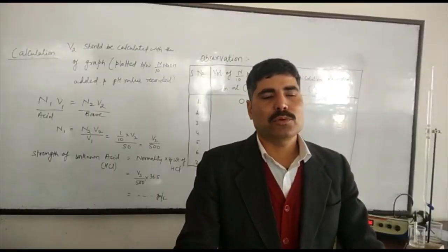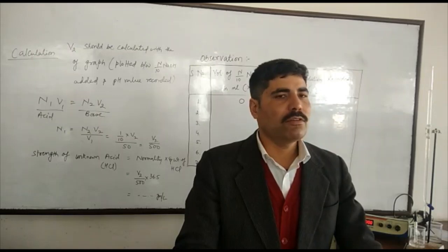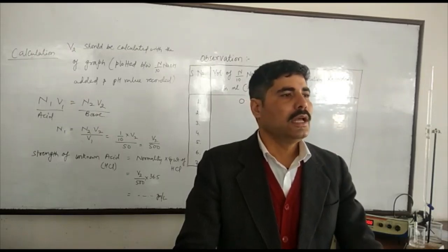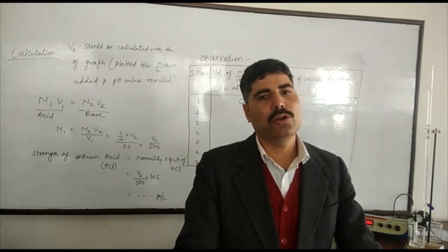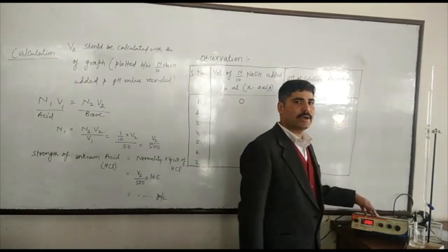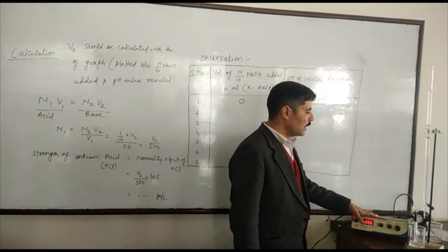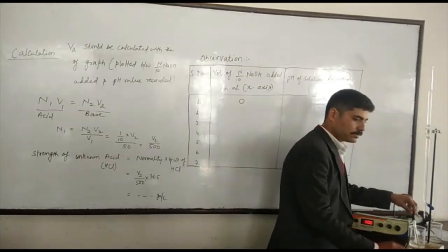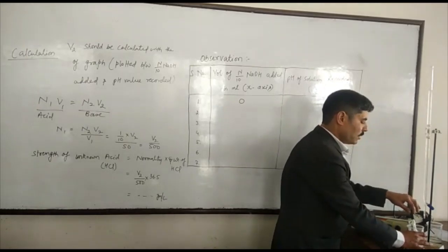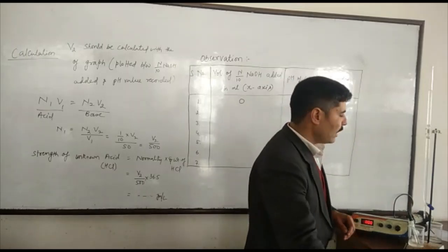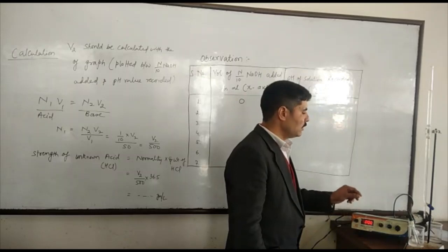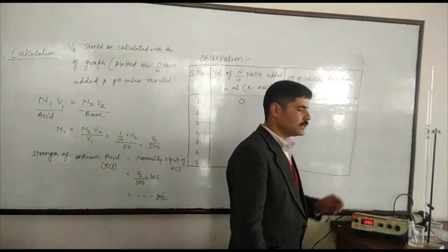Now we move to the procedure part of the experiment. First, we switch on the pH meter and leave it for 15 minutes for calibration, and then we calibrate it with the help of buffer solutions of pH 4 and 9.2 respectively. This is the pH meter already calibrated by the buffer solutions, and we dip the glass electrode in the 50 mL of HCl — the given sample solution — and write down the reading of the pH of this acid.